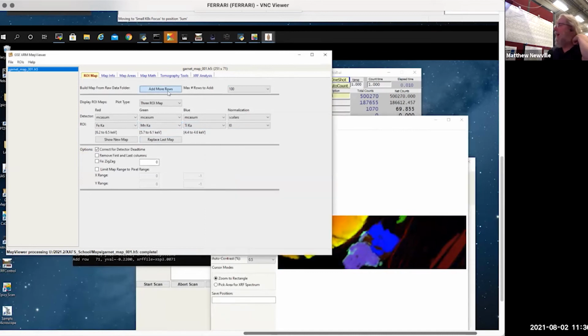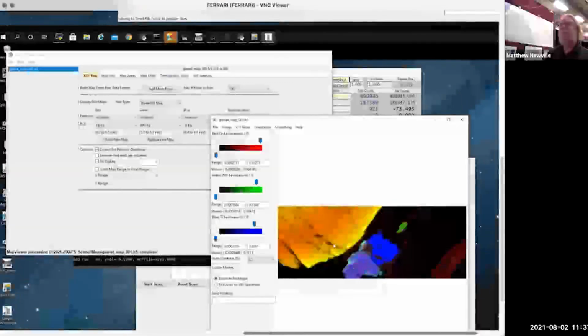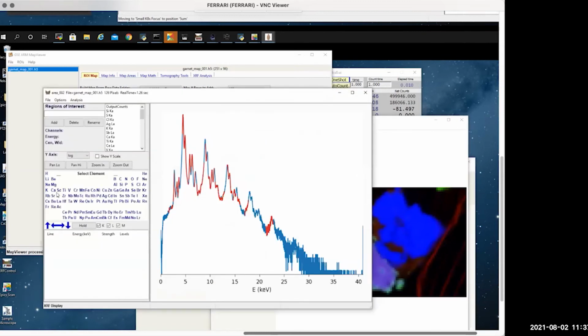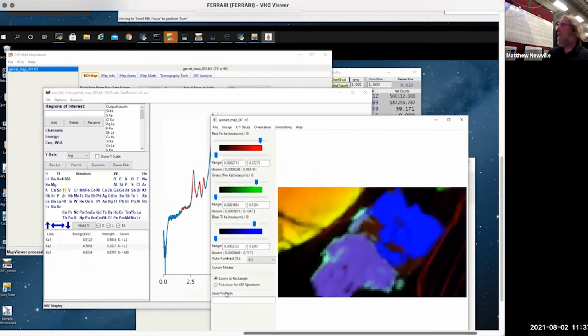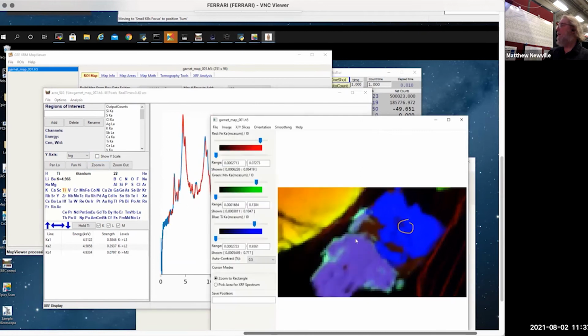Amazing. So I always find this garnet sample, it's one of our standards that we just have lying around. I always find this one to have interesting things happening, including for the rare earth elements. So there's enough manganese there that we could do the manganese XAFS on one of these spots. So to do that, in fact, what we would often do, actually, I'm not sure what this thing here is. Plenty of titanium there. Look at that. So maybe, yeah, a titanium phase, and then next to it, calcium phase. Yeah, amazing.